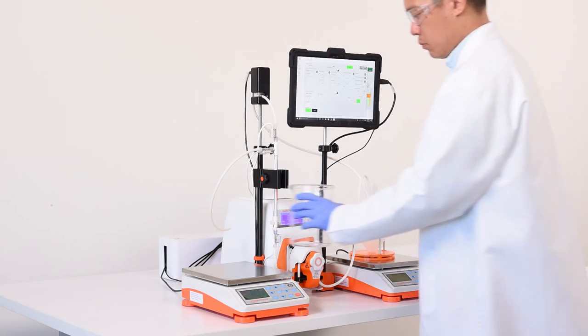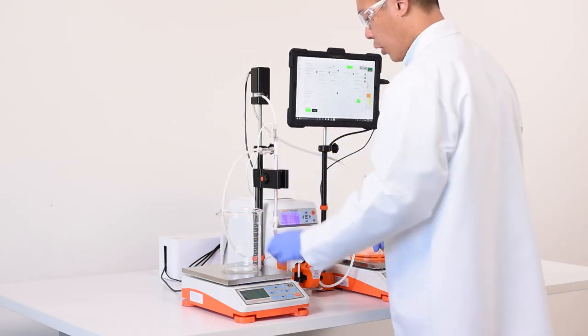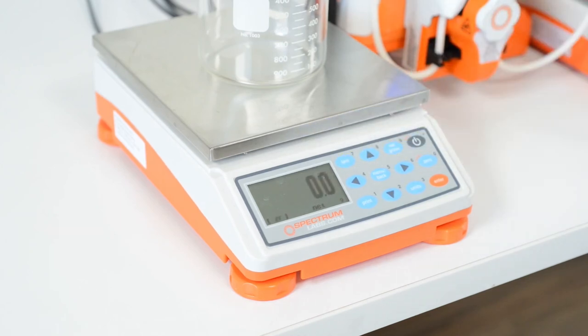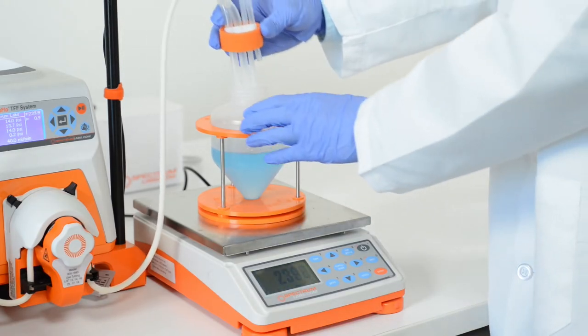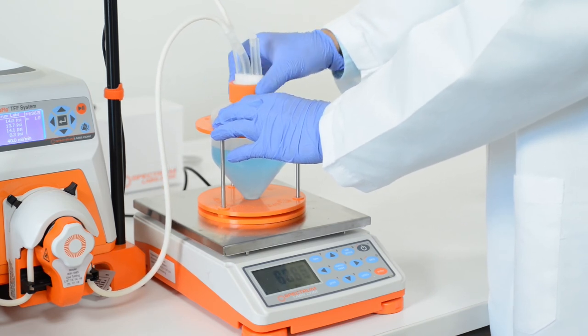Place the permeate reservoir on the permeate scale, tare it, and fill the feed reservoir with the processing solution. Properly secure the lid on the feed reservoir.